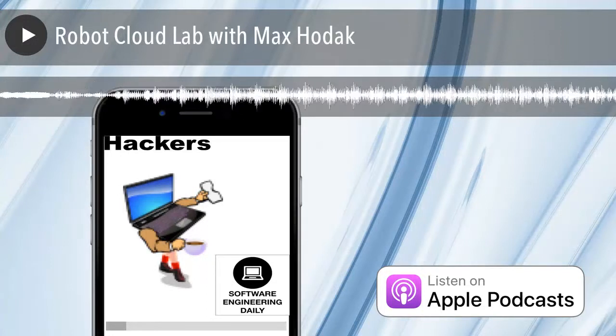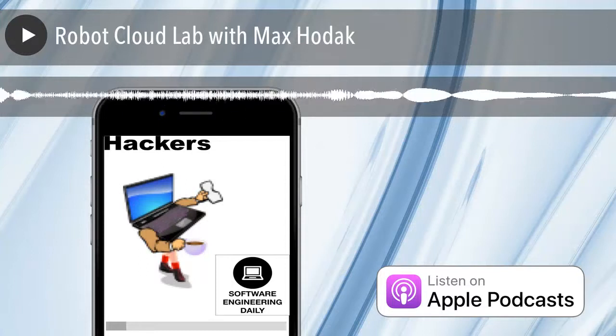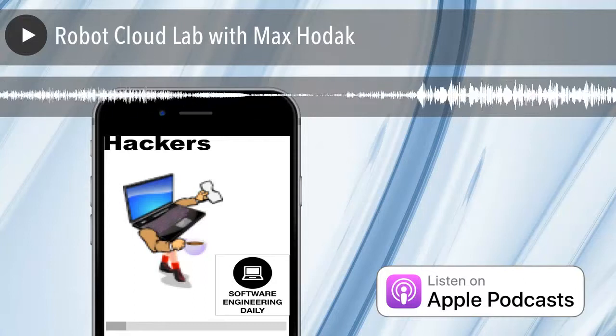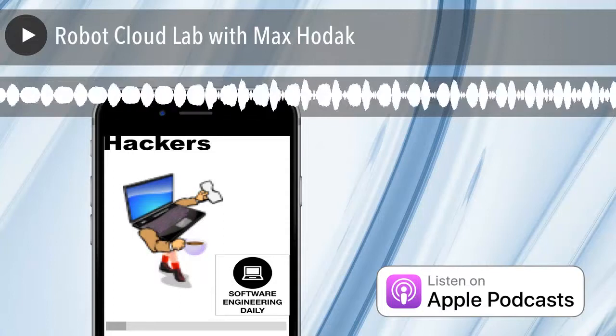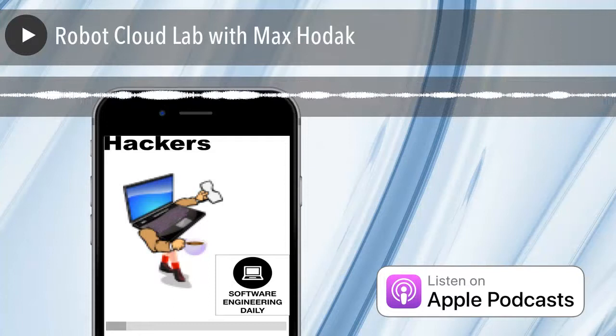So yeah, okay. So this ambiguity in the natural language protocols, this is the hypothesis that Transcriptic talks about, and that's why Transcriptic started this thing called Auto Protocol, which is a formal language for specifying experiments that removes some ambiguity.